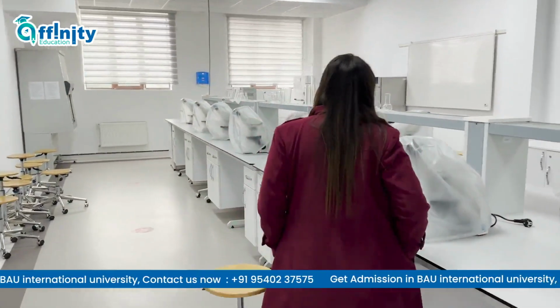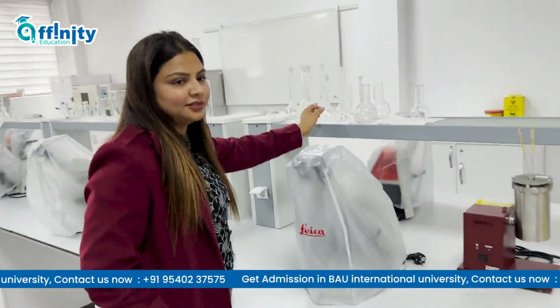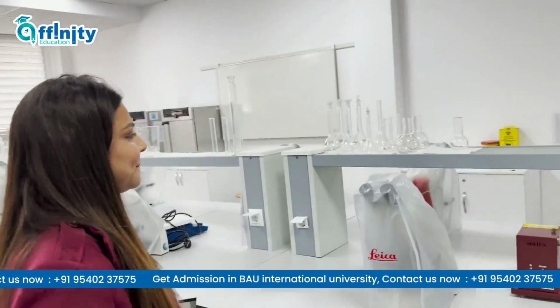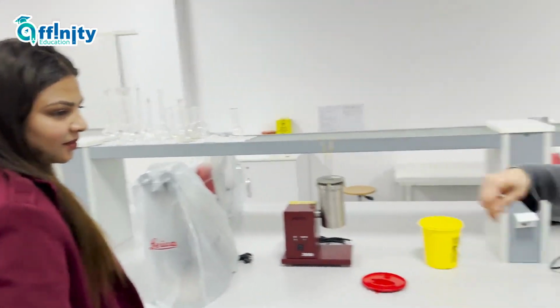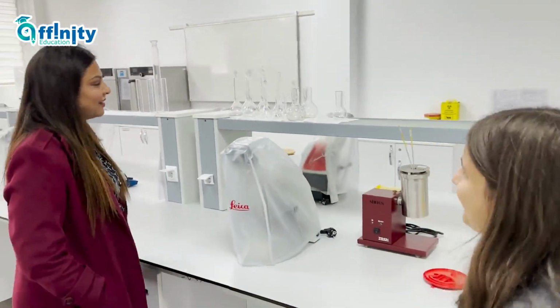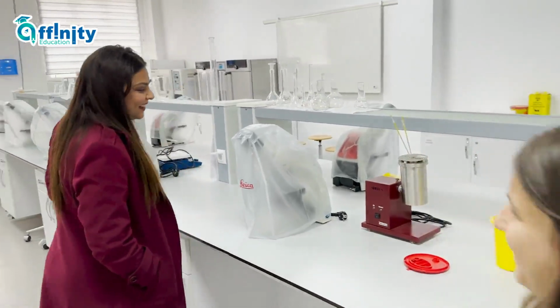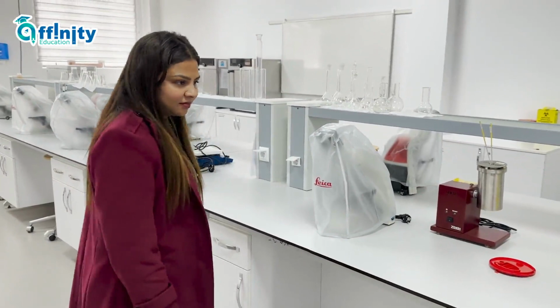And this is my favorite. This one is to do different kinds of measurement for different kinds of microbes. Some is mixing, different kinds of mixing. This one also teachers know better. Okay. My personal favorite. These are the same. Yes, they are all the same for each student.